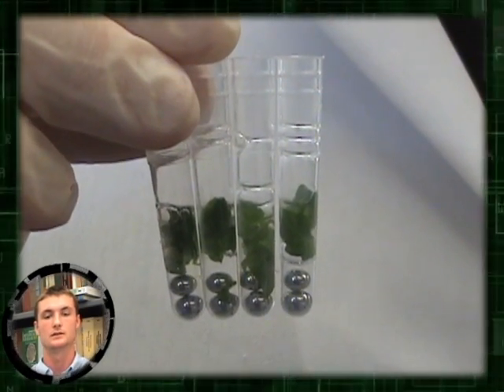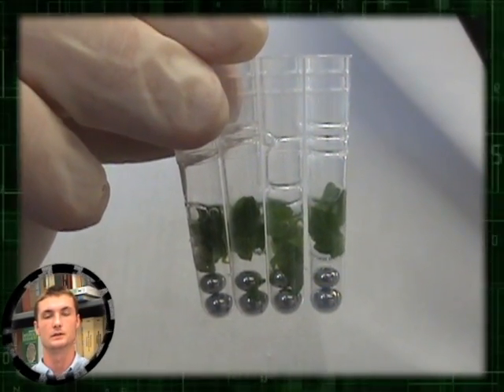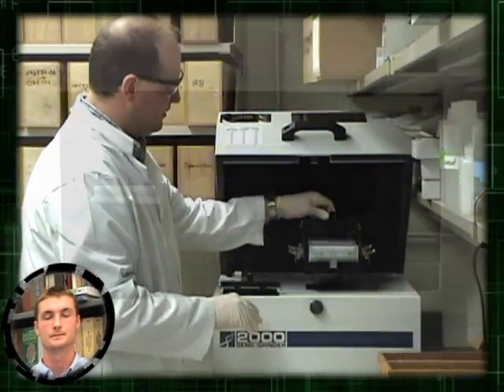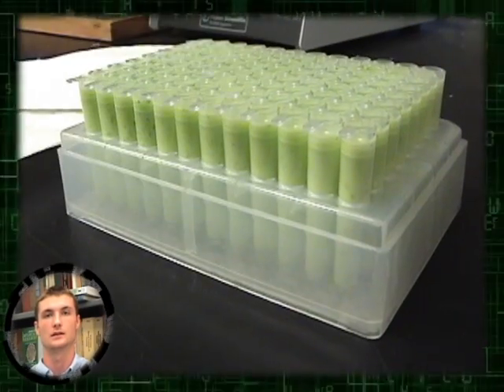Metal balls are added to tubes to help break up the plant material and an extraction buffer containing detergent is added. Racks with 96 samples are agitated to grind the tissue.